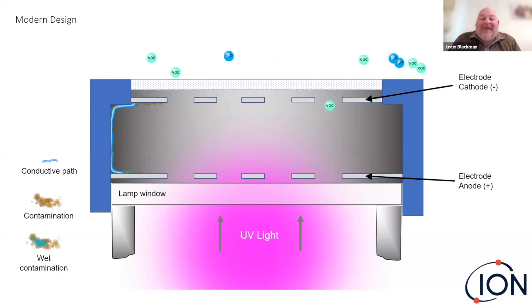It makes its way into the detector. Right now, the graphic shows still having conductive residue. We can't stop that. We show the detector wanting to show current flowing along the conductive path between positive and negative electrodes. However, on the next slide, if I can make it do the right thing, here we go.